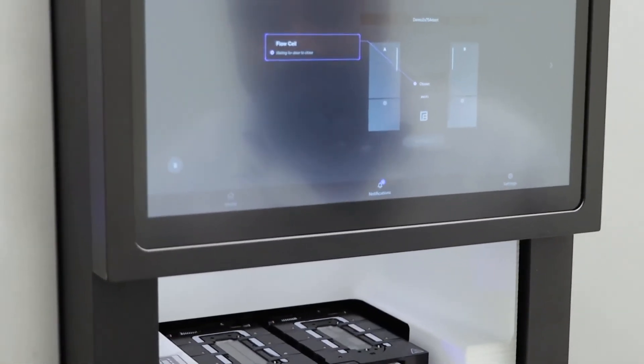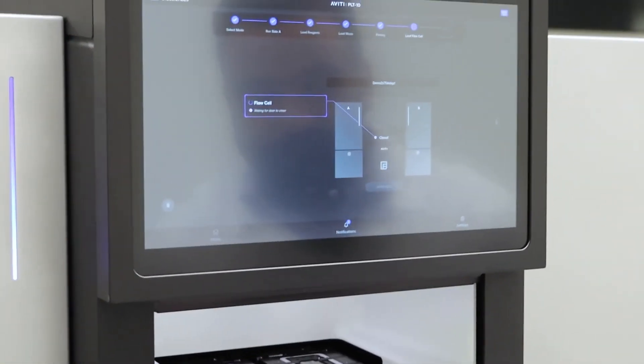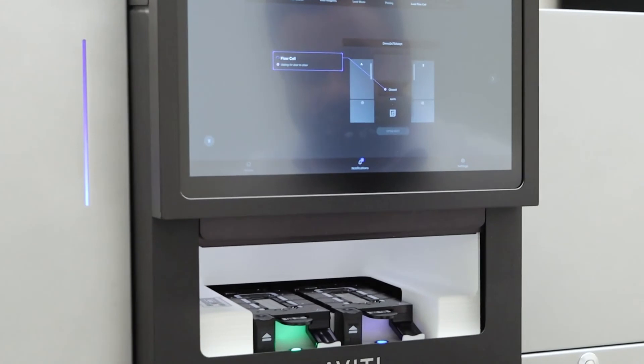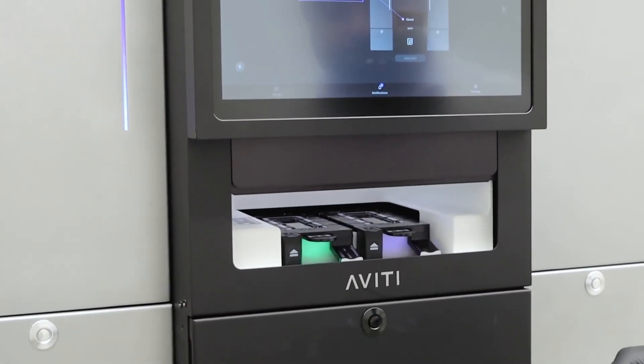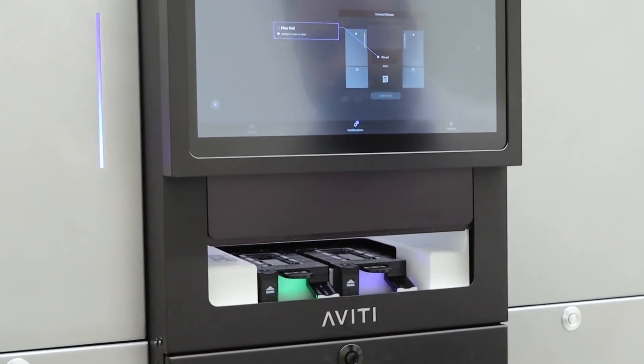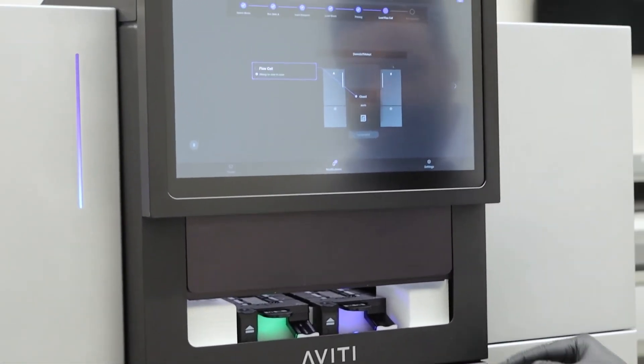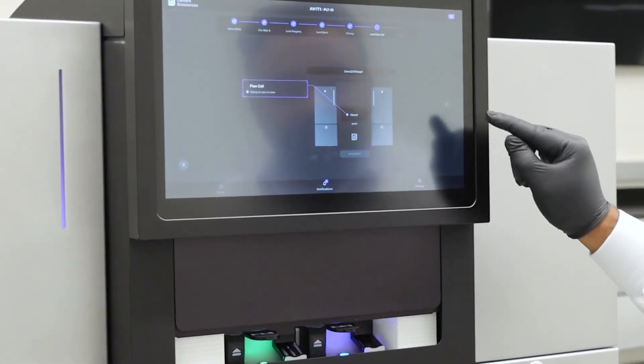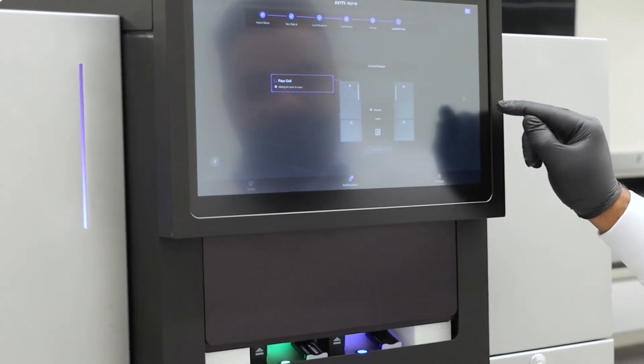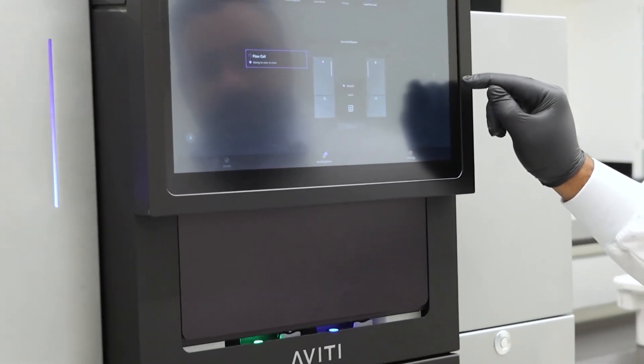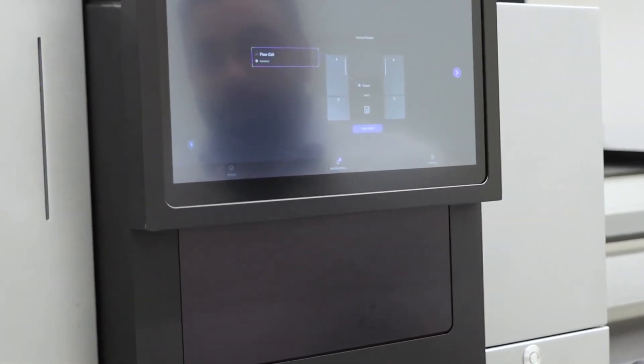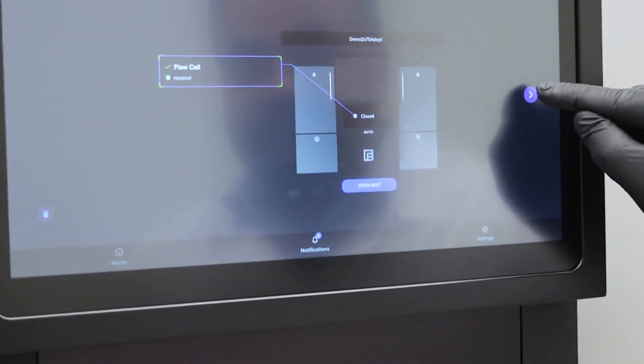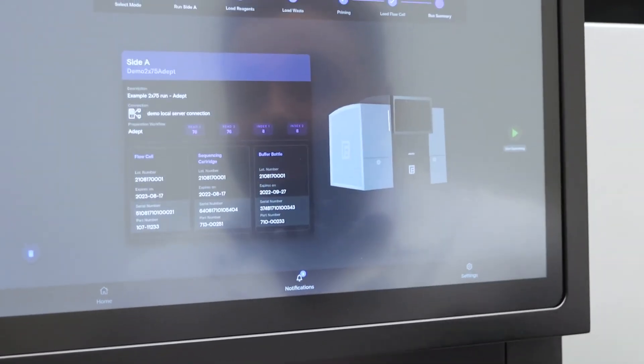Close the nest, to which then once successfully closed, you'll be prompted to move to the next step.